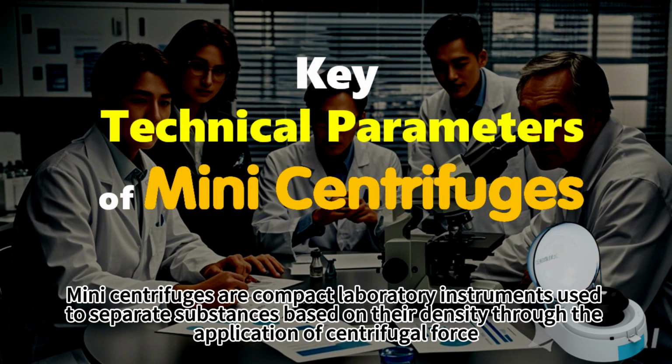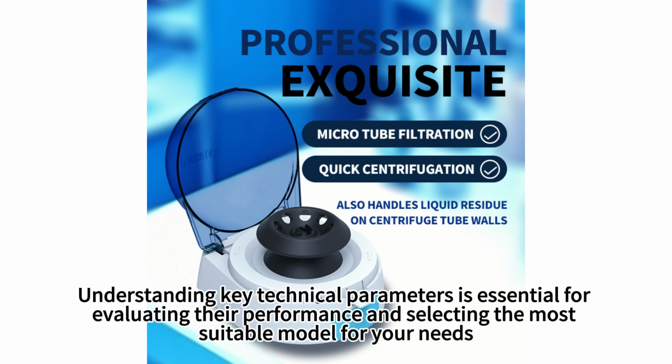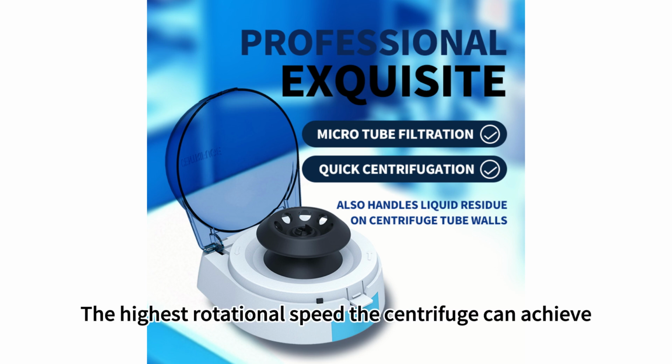Mini centrifuges are compact laboratory instruments used to separate substances based on their density through the application of centrifugal force. Understanding key technical parameters is essential for evaluating their performance and selecting the most suitable model for your needs. Main technical parameters: Maximum speed, RPM. 1. Indicates the highest rotational speed the centrifuge can achieve.